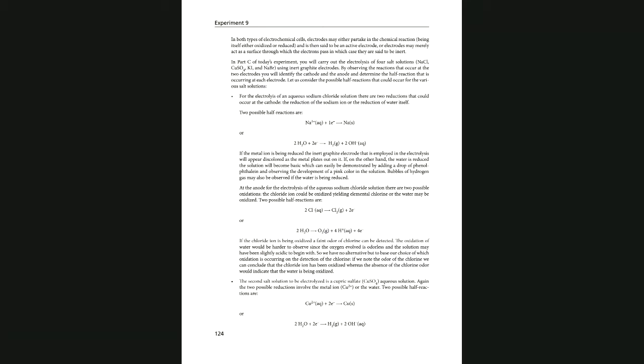So if you see the hydroxide ion produced by evidence of pink color, then from these two choices, you pick H2O plus electron, giving hydroxide ion and H2. This goes to the reduction half. Where does the reduction take place? That's in the cathode. So on the report sheet, you are going to write this equation, only this equation. Out of the two choices that you have, you only write this one. Don't write this or that. This or that is before you perform the experiment or before you watch the video.